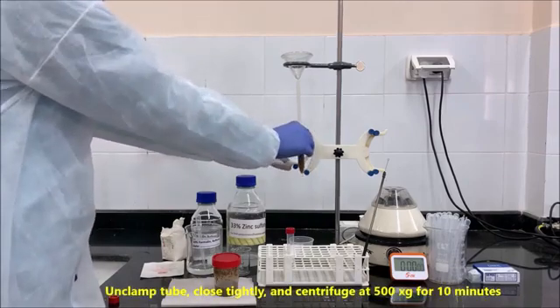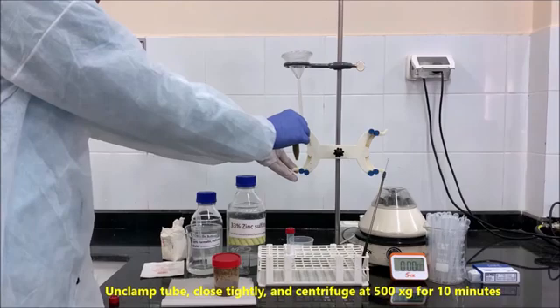Unclamp tube, close tightly, and centrifuge at 500 G for 10 minutes.